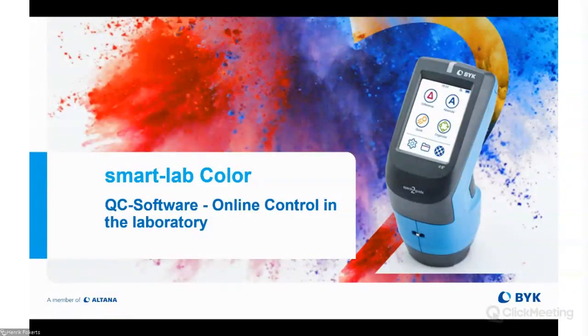Today I will talk about software. It's our Smart Lab Color software. It's a QC software for online control in the lab.